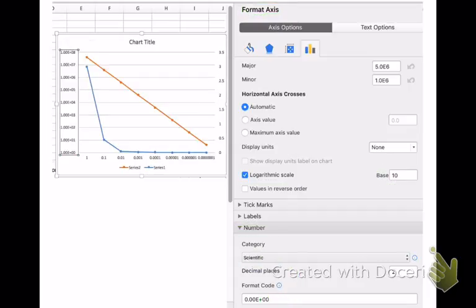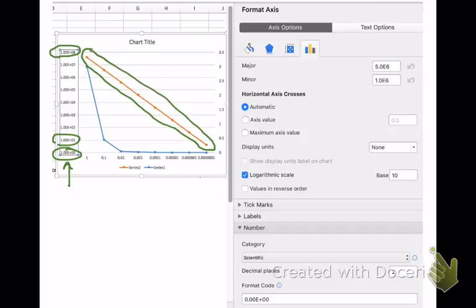So once we select those, our graph, our axis will shift, of course, the numbers on that axis, so that we've got 1E to the 0, all the way up to 1E to the 8. And of course, that's also going to change the way our data, how that graph looks, because when you plot numbers like this on a log scale, we're going to go from being this sharp curve that it was, looking similar to this, to a straight line.